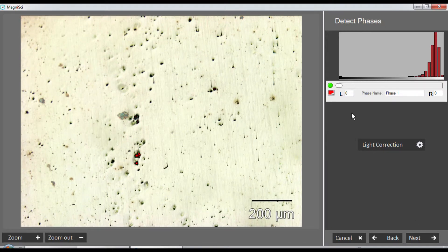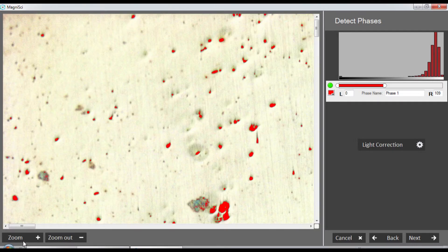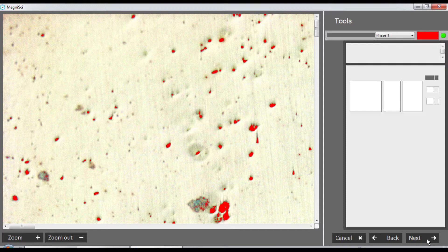Now I detect my particles or inclusions with a simple threshold - that is good enough, and it gives a very good selection of particles. There are of course other areas being detected that are not really inclusions, but we have a chance to remove them later on depending on size.